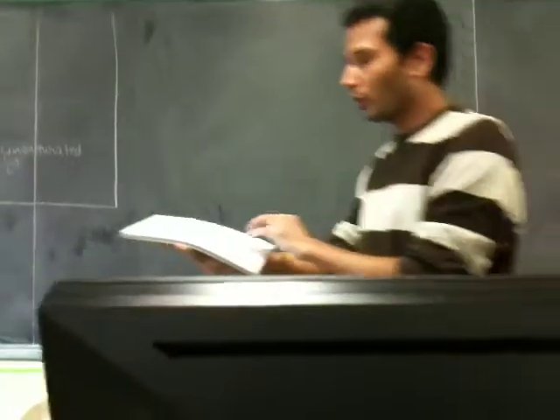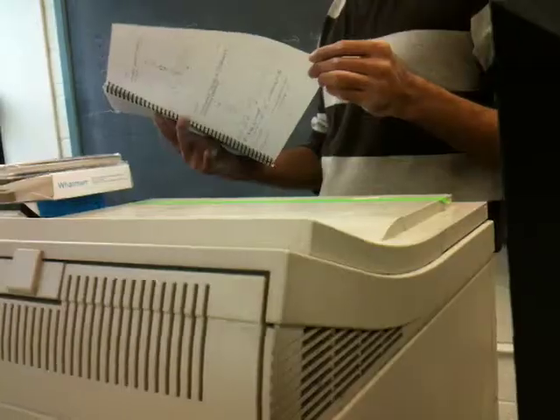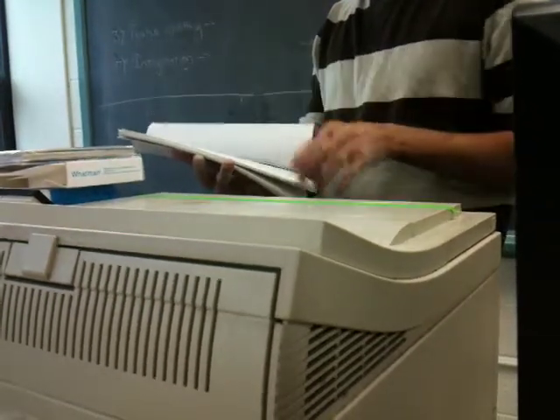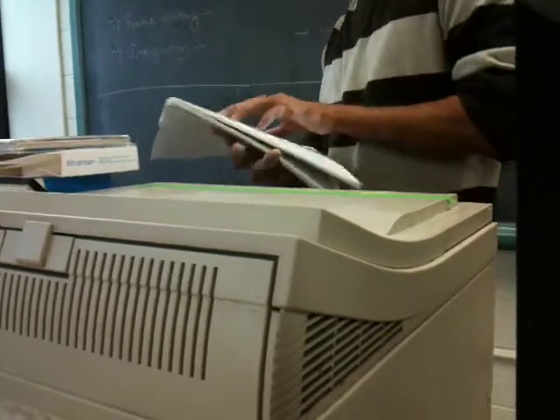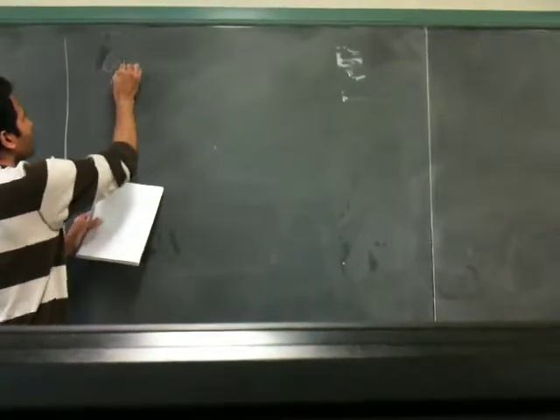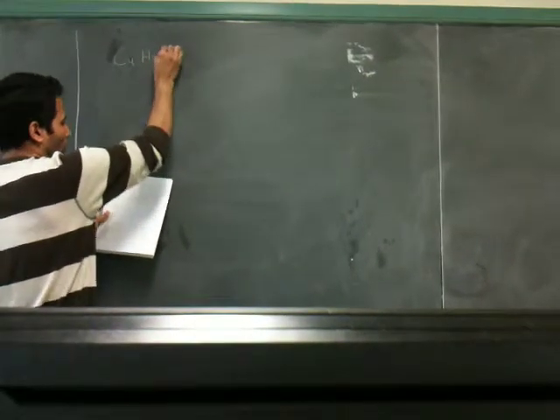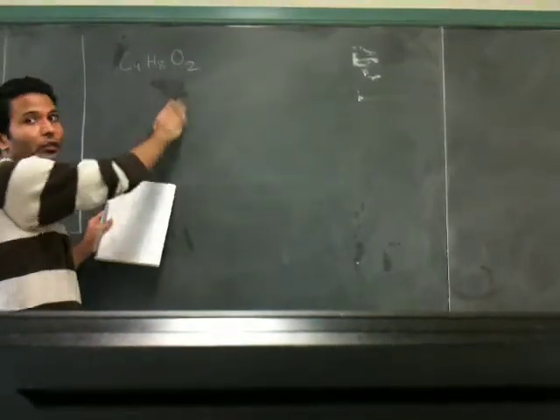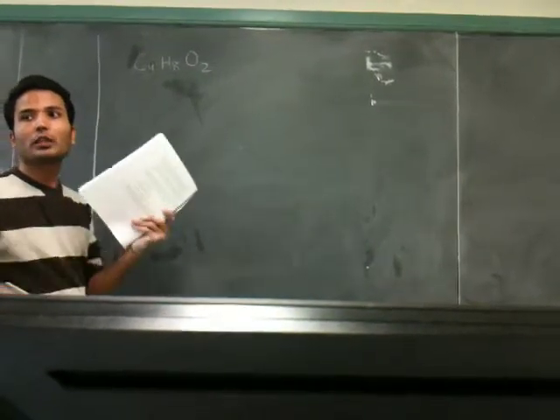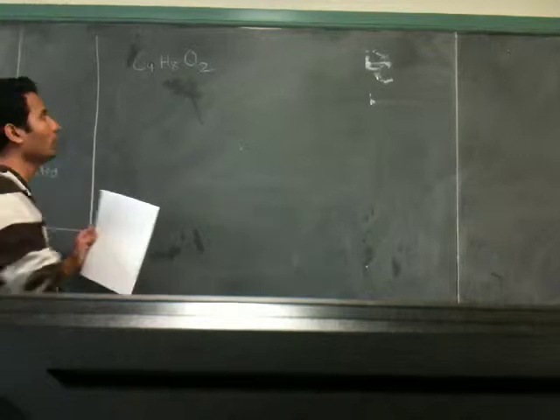I am going over one of the questions which you always have trouble with from the last lab. So the last lab, you had a problem with C4H8O2, and there were 2 spectra for this. These are the last 2 questions which you submitted with the confirmation analysis. Okay?